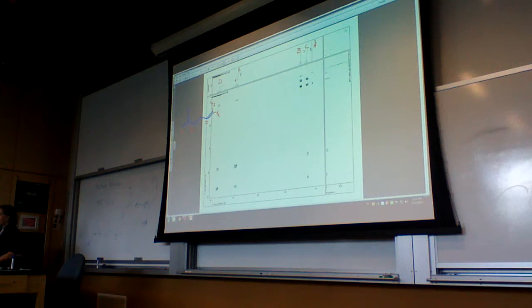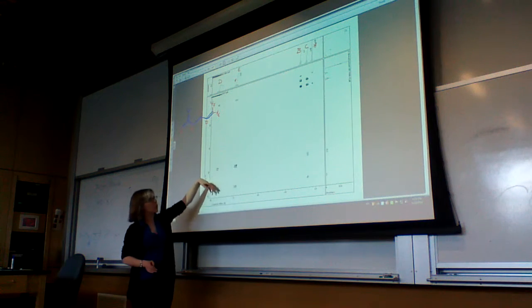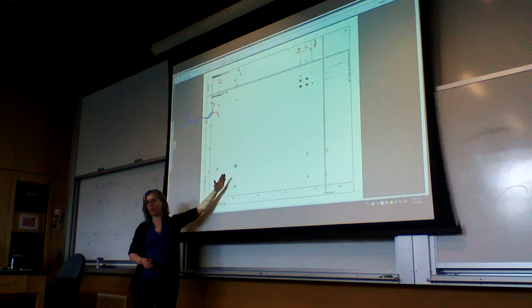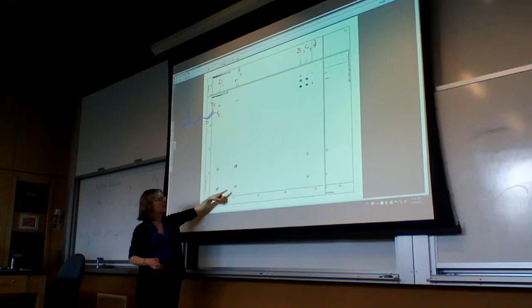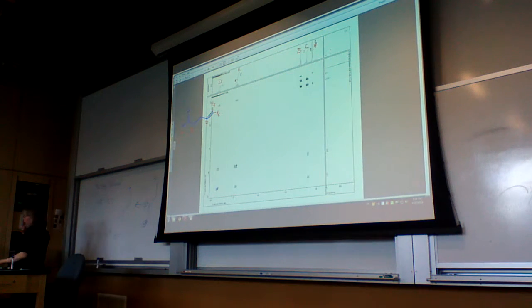Now, with the COSY, we're going to look at what the cross peaks are. Remember, the diagonal is essentially ignored, and then we're going to look at the cross peaks. We really only have to look at half of them though, because it's symmetrical. If you're looking at hydrogen versus hydrogen, you're going to get the same peak here as you do here. So we're going to look at the top half here. And in this example, we've got several cross peaks.